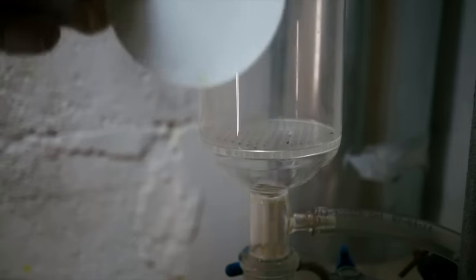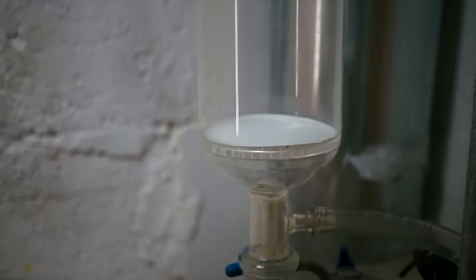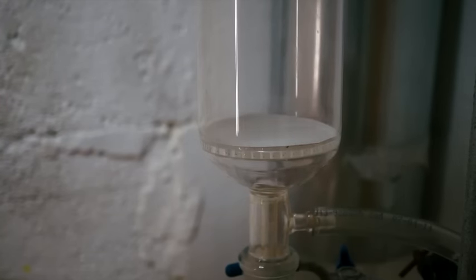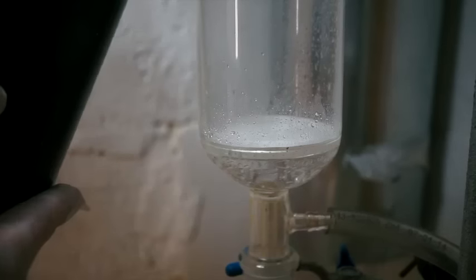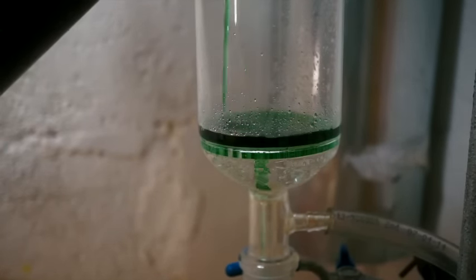I use a very fine filter to remove all particulate. Be sure to pre-wet the filter so it won't move around when you pour your solution into the funnel. Filter the solution using a mild vacuum.